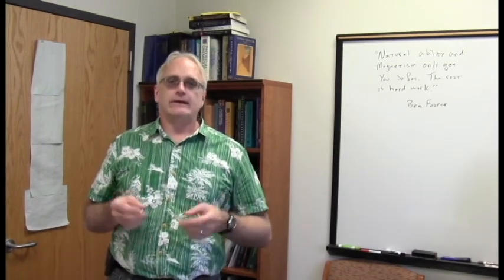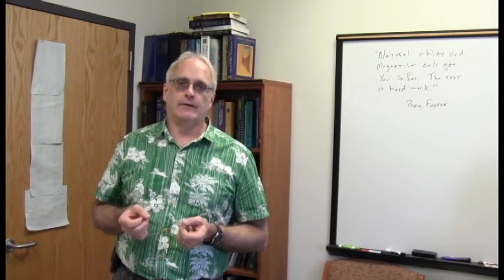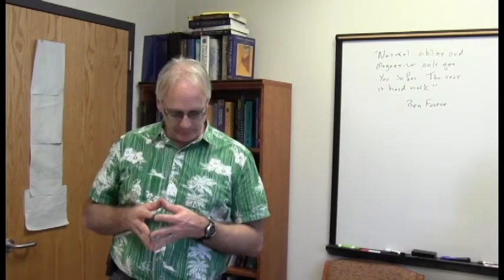And so back in the 50s and 60s, there was a strong need to standardize NMR spectra. And that led to a search for a chemical compound that we could all agree would be the standard. And so the search was on for a reference standard to be used in NMR spectroscopy. And it was decided whatever you chose had to meet a number of different criteria.